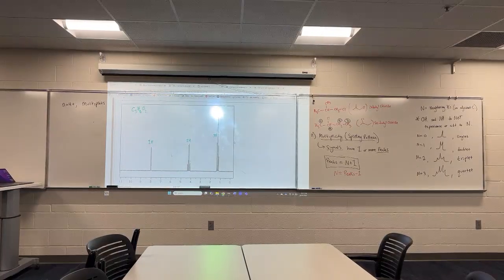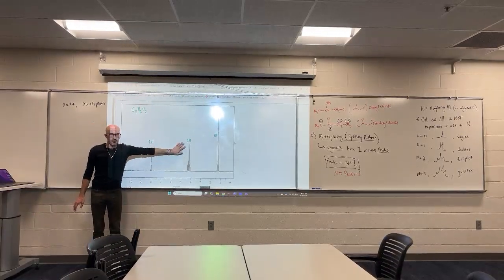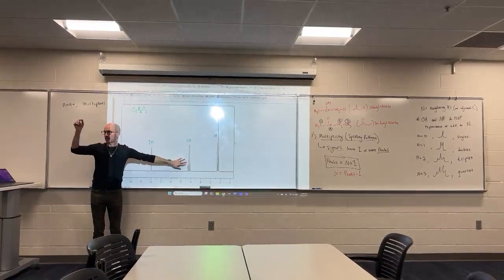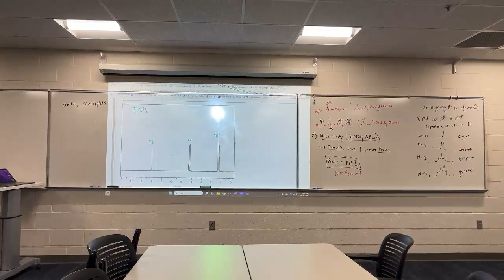Like, is the CH2 connected to the CH? Is the CH2 connected to the CH3? How would those splitting patterns tell us that? Look at this, D. When you've got the 2H signal, how many peaks do you have? Based on that, how many neighbors does that CH2 group have?